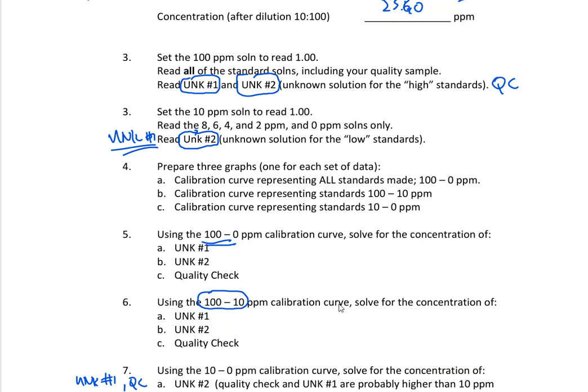Let's just leave those out. So what would happen to your graph if you plotted only 10 to 100 and only those absorbances? Does it make that graph more linear? Does it affect your numbers in any way, in any form or fashion? Just again, a different look at the data and the perspective of the AE instrument, and that is it.